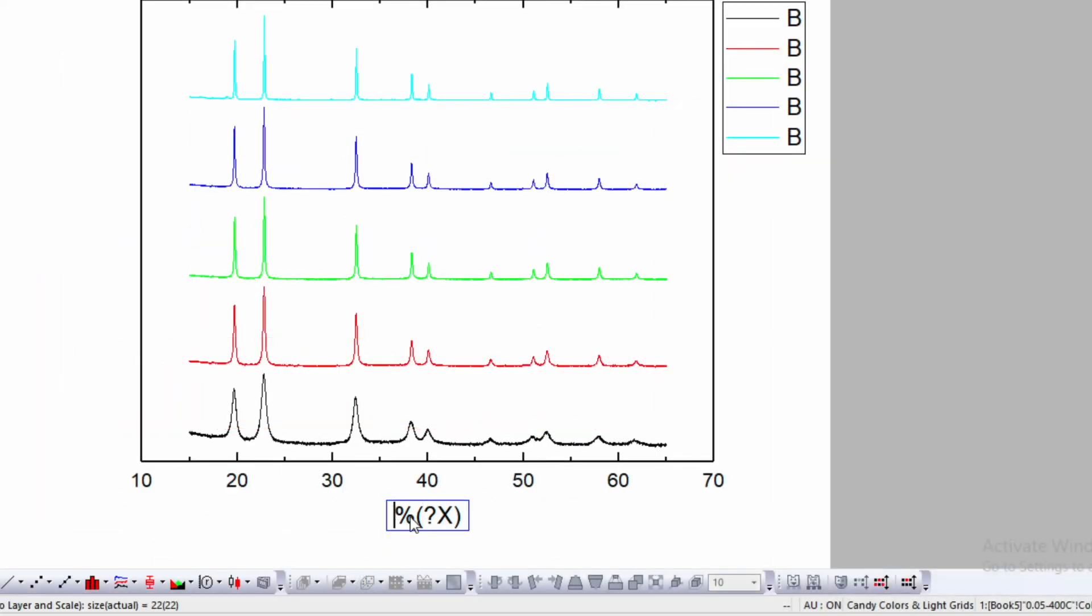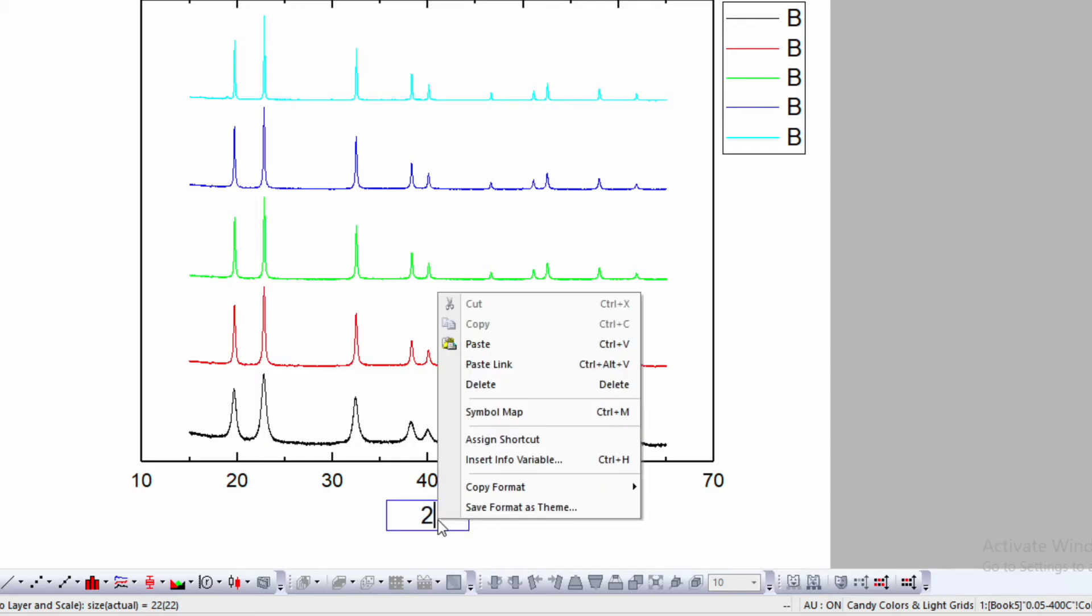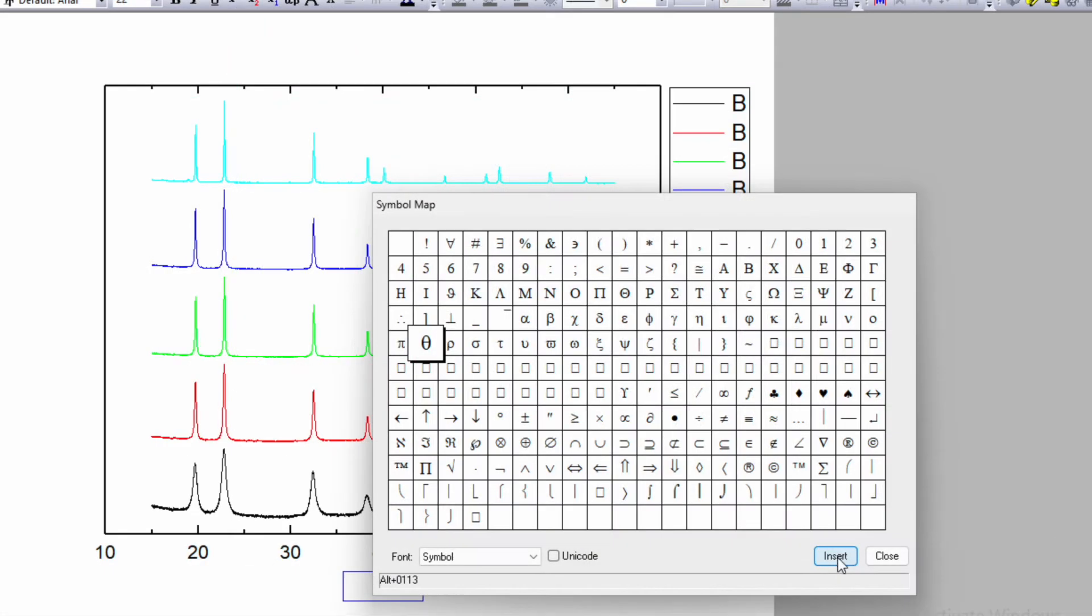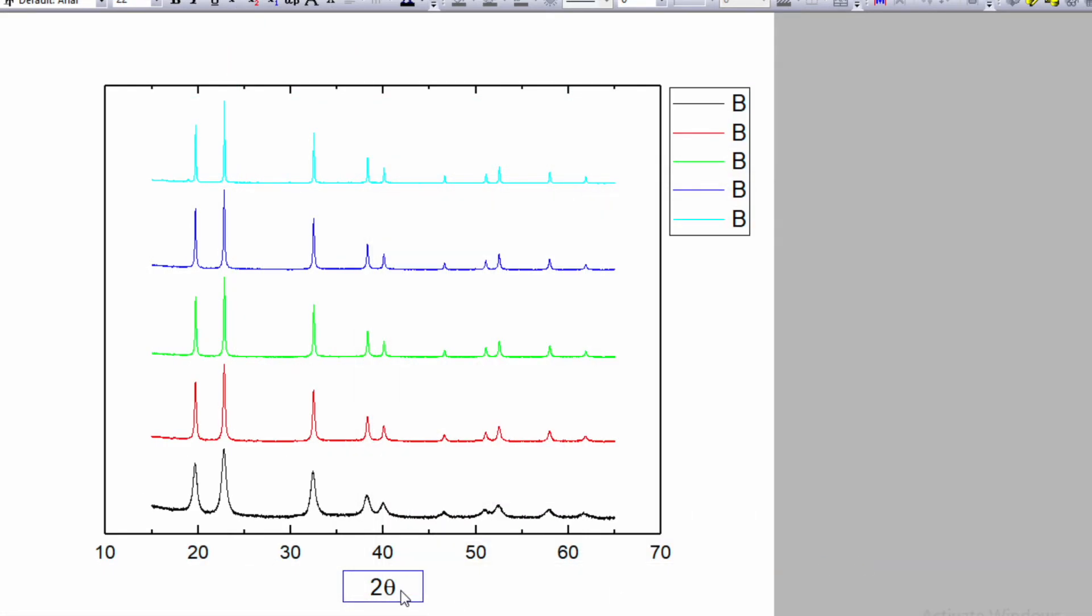Here is two theta. Select it, type 'two', right-click, and go to symbol map. In the symbol map, select theta, insert it, and close. In the bracket, write down the unit: deg.